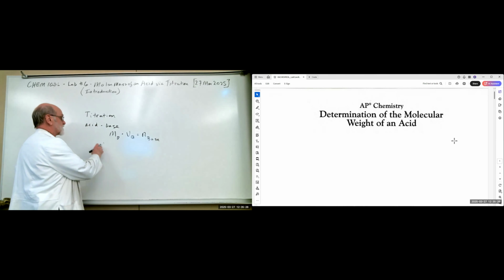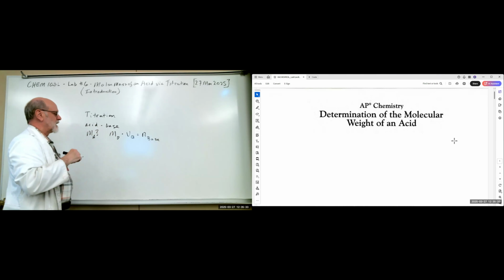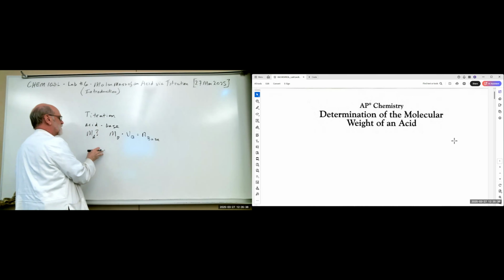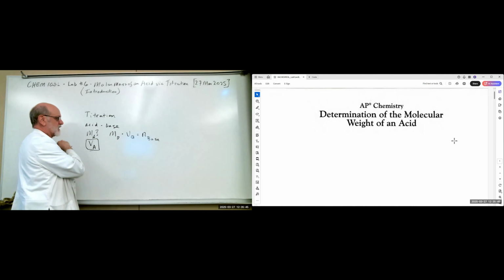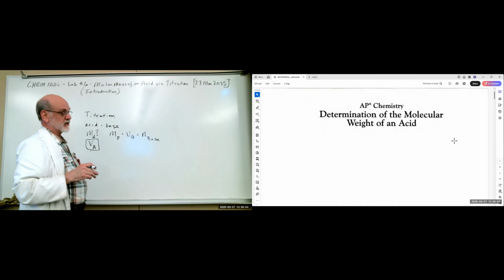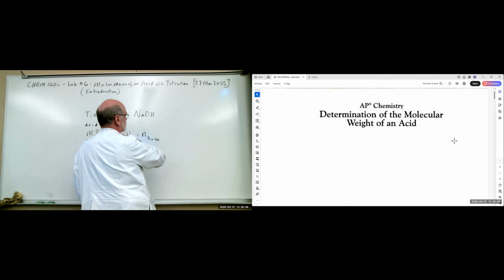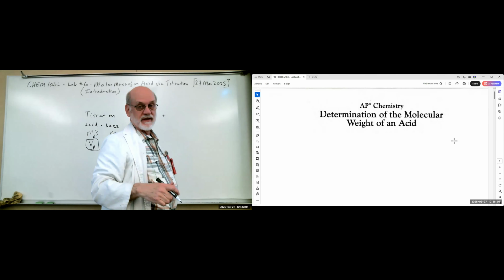So what you want to do, since you don't know the concentration here, is add enough base to a known volume of acid. You can know this one very accurately. So that's the unknown. And in our case, we've got a discrepancy between the number of hydroxyls in our base and the number of protons that can be delivered by the acid.